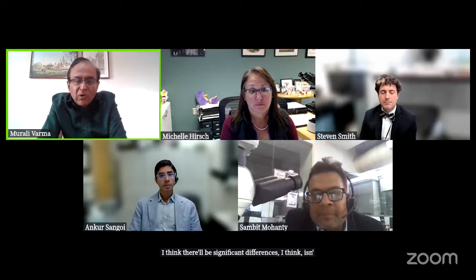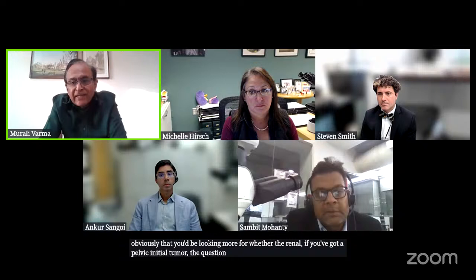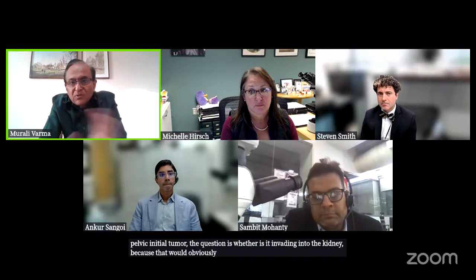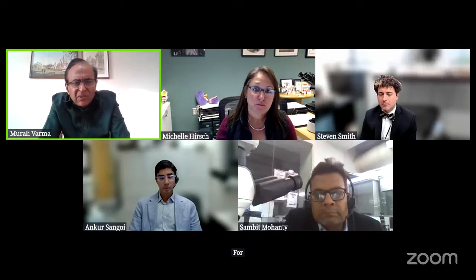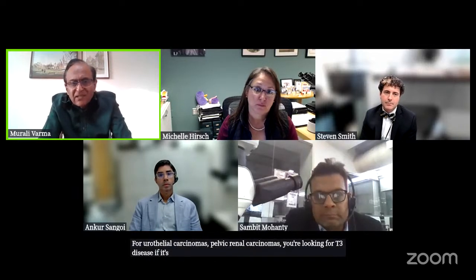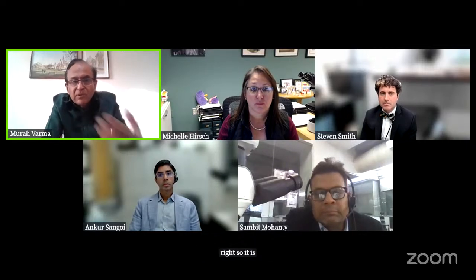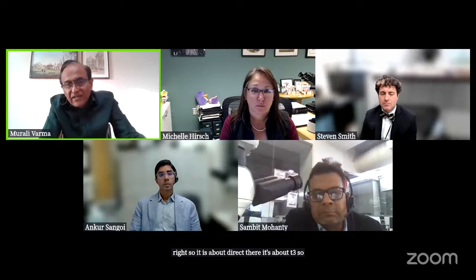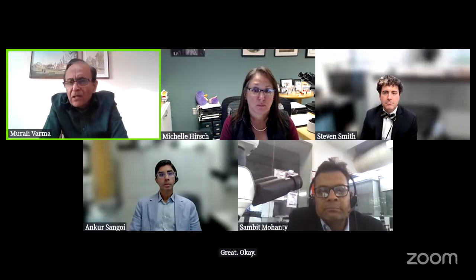I think there'll be significant differences. One would be obviously that if you've got a pelvic calyceal tumor, the question is whether it's invading into the kidney, because that would obviously change the stage. So that interface. For urothelial carcinomas, pelvic renal carcinomas, you're looking for T3 disease if it's extending outside into the fat, right? But you're not looking for things like sinus fat invasion per se, right? So it is about T3. So if the tumor is invading the sinus fat, it becomes T3, right? Okay. I've got that there.